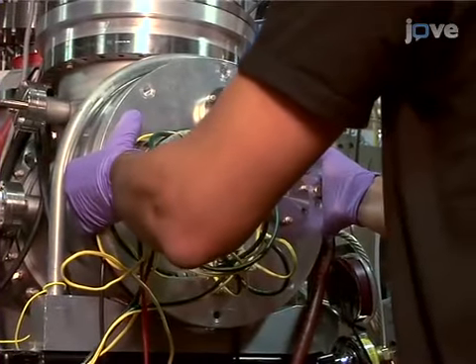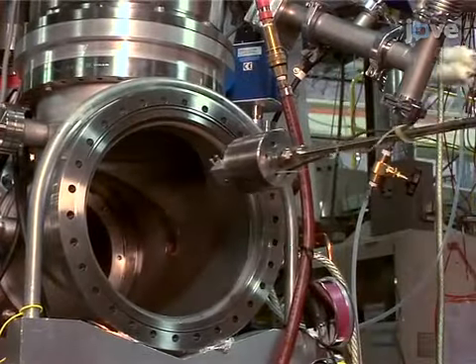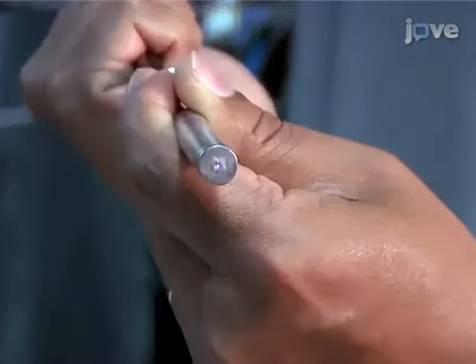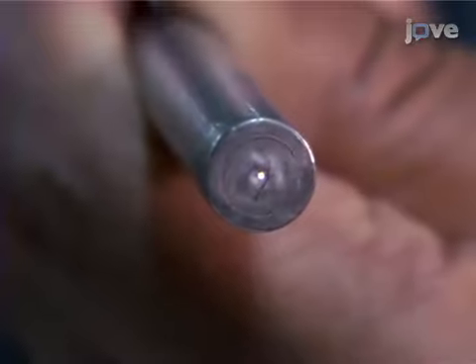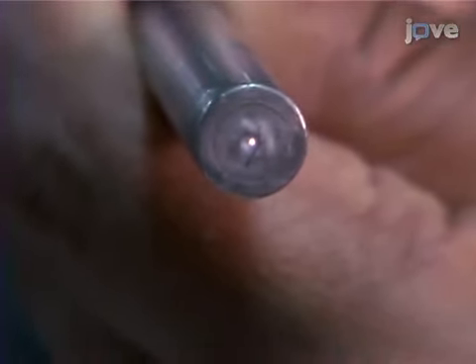To begin, remove the back flange and disassemble the 3/8 of an inch stainless steel tube from the apparatus. Make sure it is clean and the 100 micron orifice is clear by looking through it at a light source.